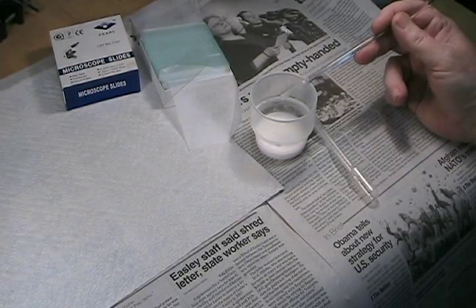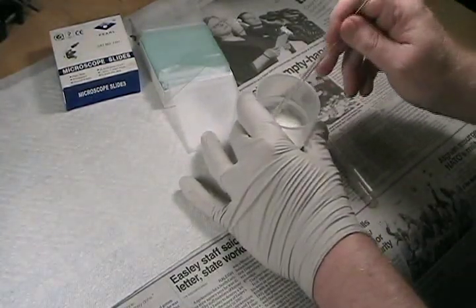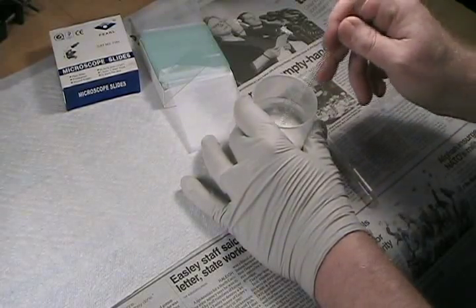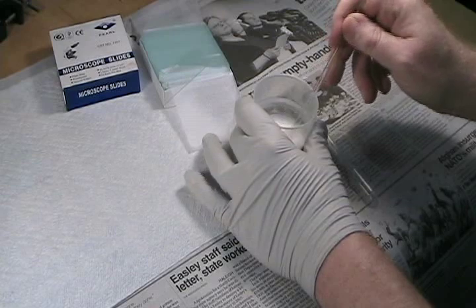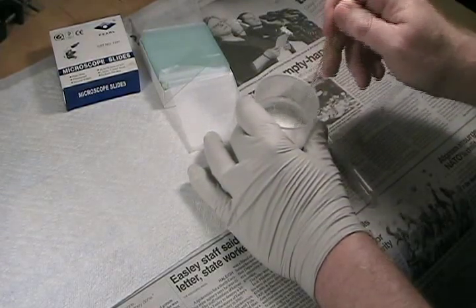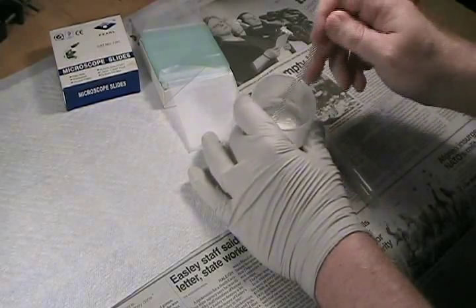Okay, let's get started. I've already mixed the alumina and the binder and added water. You use about 1.25 mL of water per gram of alumina and roughly 15% by weight of the binder, the plaster of Paris, and stir it until you get a fine slurry. You want absolutely no lumps or bubbles.